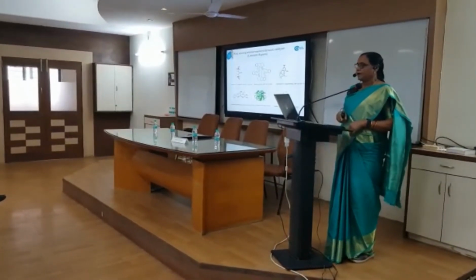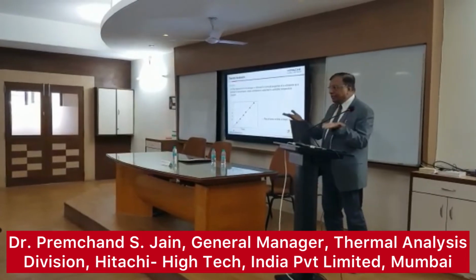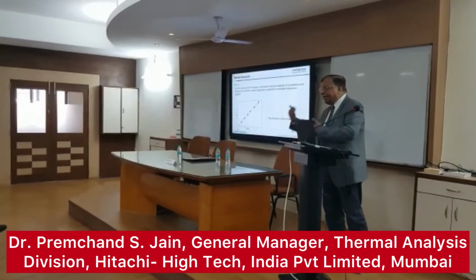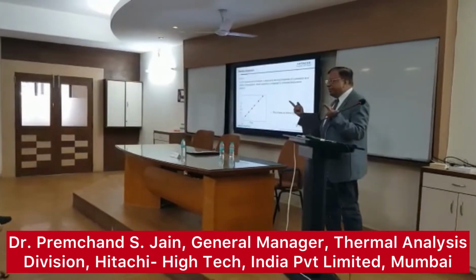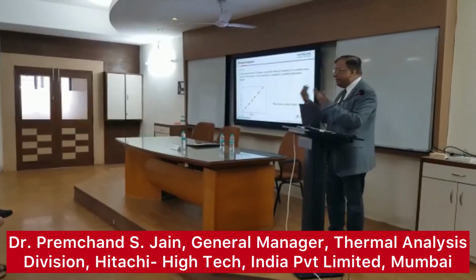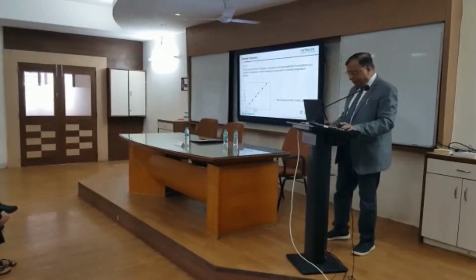effect. And in thermal analysis, the technique is to heat the sample or to cool the sample in a linear fashion. So let us say, for example, 5 degree per minute, 10 degree per minute, and whenever you heat any sample it will undergo two different types of property changes, a physical property change and a chemical property change. And both these physical and chemical property changes are very precisely measured in thermoanalytical technique. Okay, so this is a very simple definition.